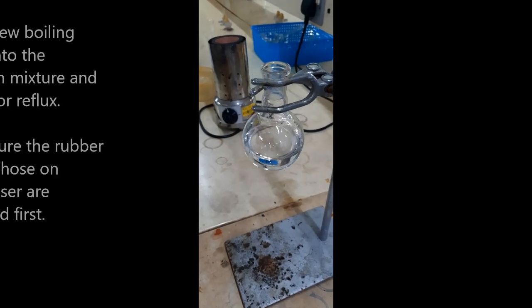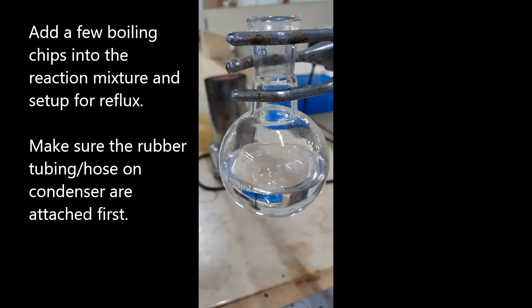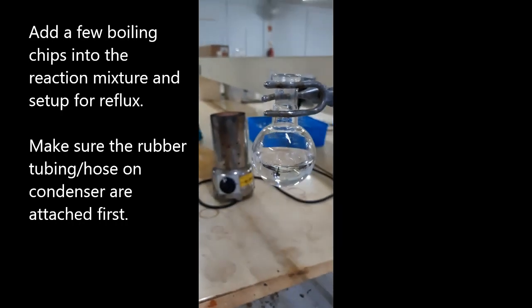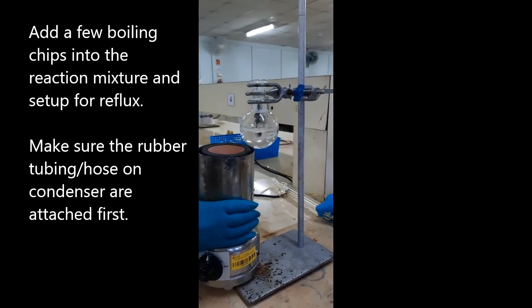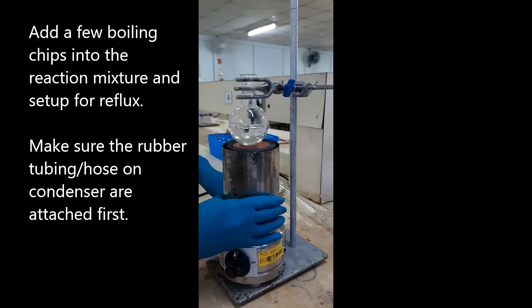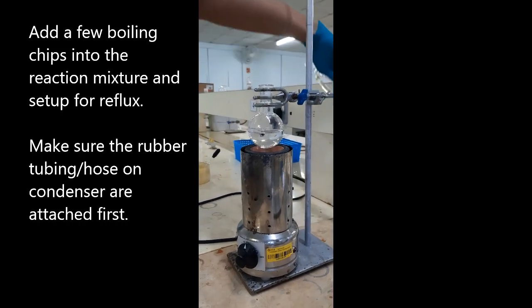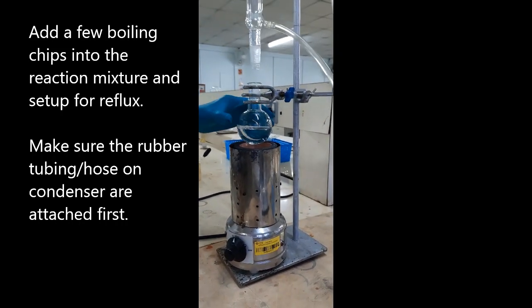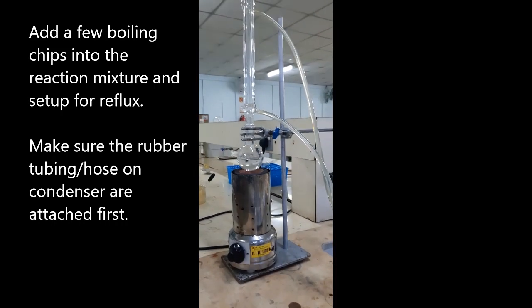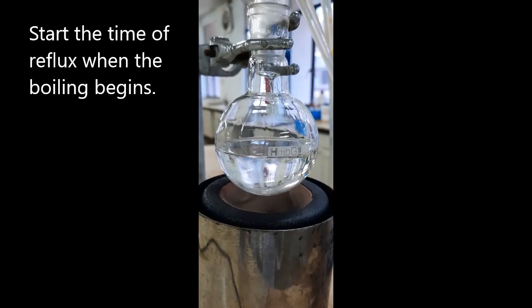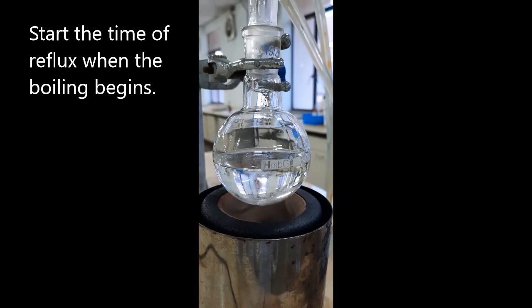Boiling stones must be added when heating organic liquids in the round bottom flask. Then assemble the apparatus for the following reflux process. Always attach the rubber tubing first to the condenser before assembling the distillation setup. The reflux duration only begins when the mixture starts to boil.